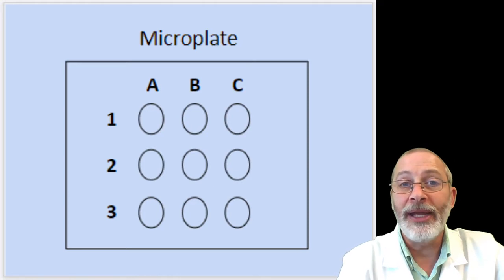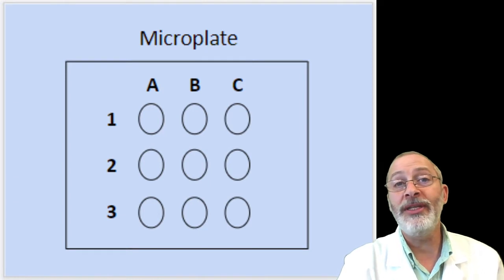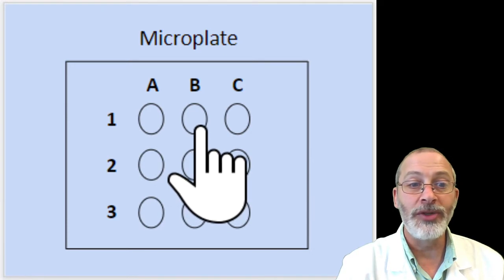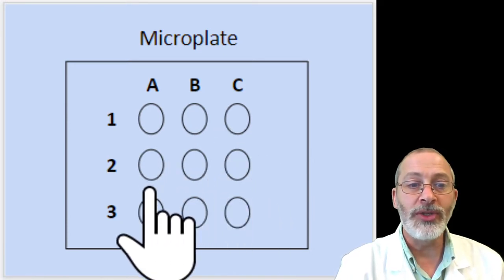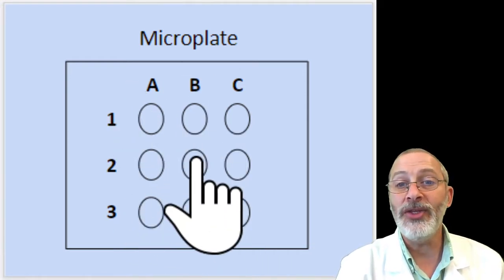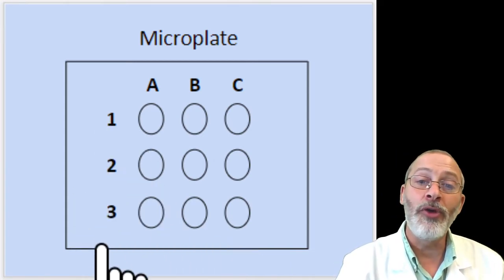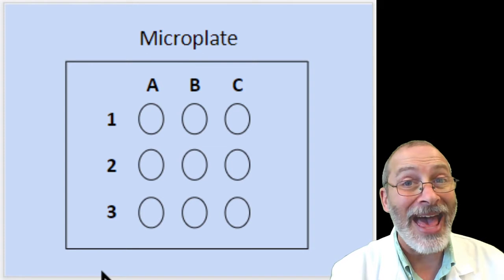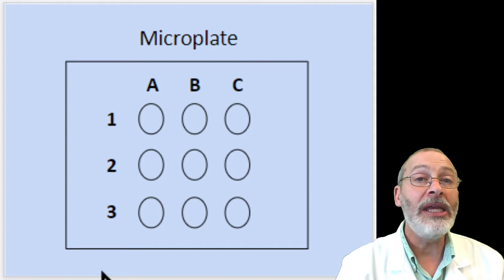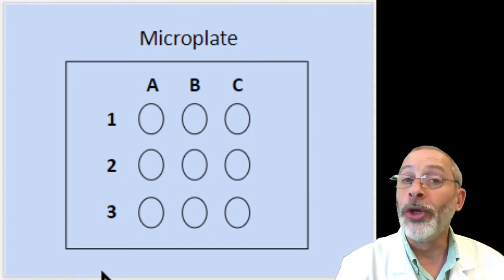And the microplate, and I'll show it to you in a moment when we get to our virtual lab, is simply a porcelain dish or porcelain plate with little reservoirs in them. These little reservoirs are indented in, and we're going to be using just a small volume of 3 solutions: solution A, solution B, and solution C. And we're going to be performing 3 different tests in the lab in order to identify whether each solution is an acid, a base, or neutral.